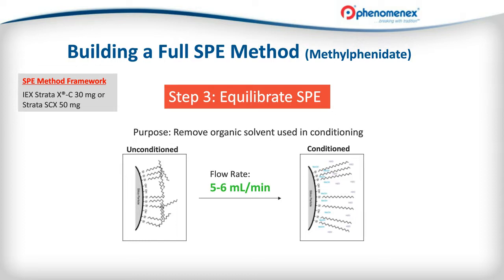I find it helpful and just kind of reassuring, to be honest with you, but remember that ion exchange interaction is so much stronger than reverse phase interaction that we could actually just condition and load our sample on if we wanted to, and really probably not see too much of an ill effect from doing so. General rule of thumb here is to match the initial sample diluent. So if we're diluting in formic acid, we should be equilibrating with formic acid.